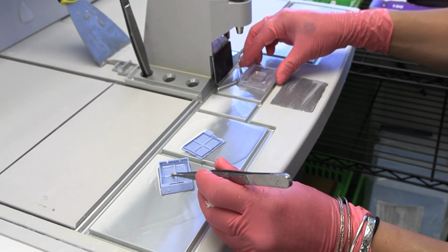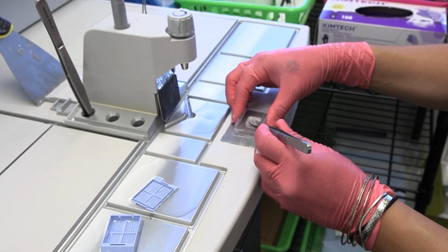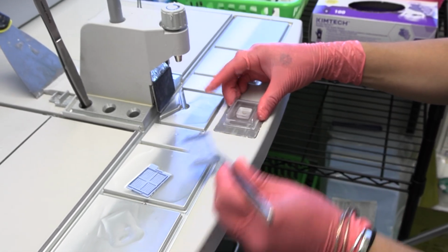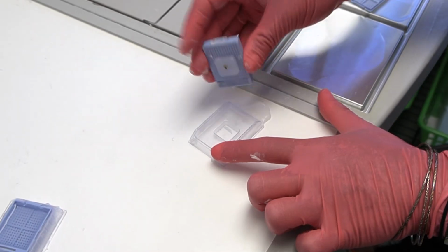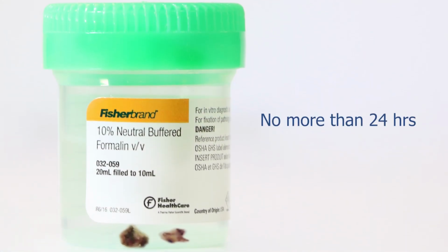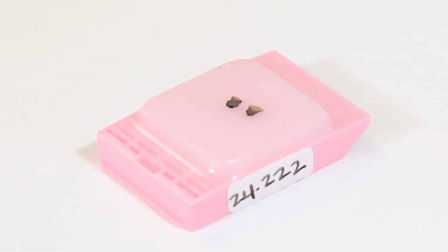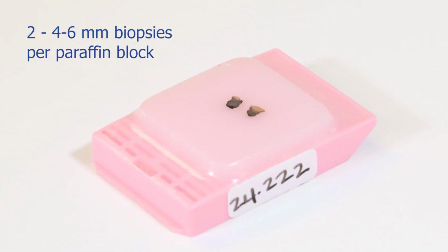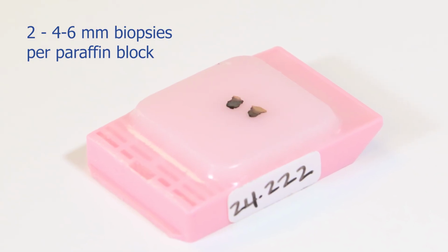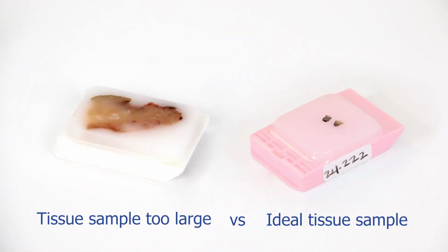The PCR test is performed on formalin-fixed paraffin-embedded tissues, or formalin-fixed tissues that we can process for paraffin embedding. For PCR testing, it is best not to fix tissues in formalin for more than 24 hours. Ideally, no more than two 4 to 6 millimeter full-thickness skin biopsies should be in one paraffin block, and excess paraffin should be trimmed. Larger tissue samples should be avoided, as that can cause problems with the PCR process.